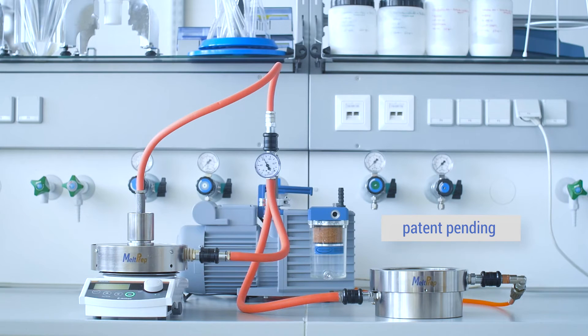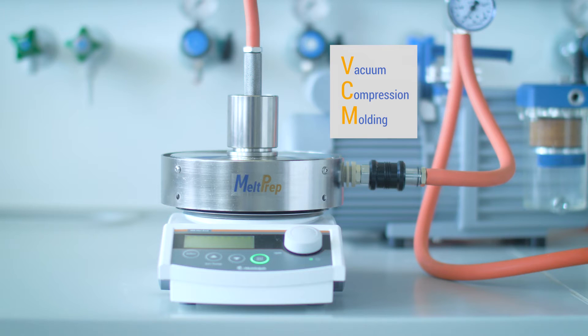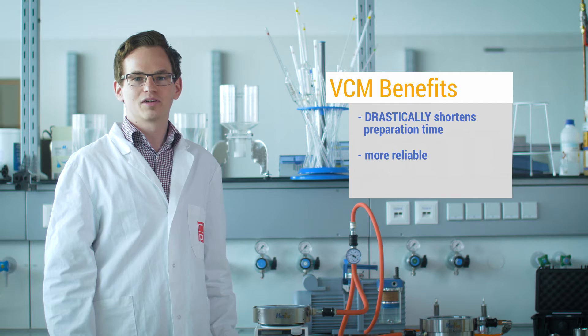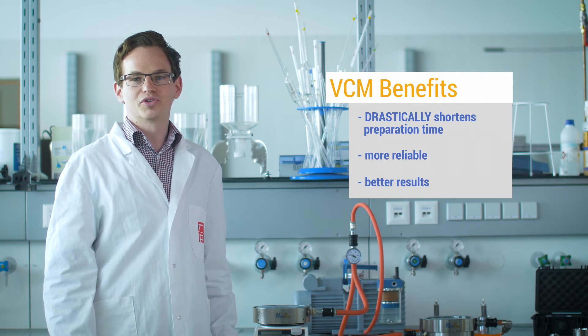I came up with a small scale production process of polymeric samples. It is called vacuum compression molding. It cuts down preparation time to a few minutes, all the while being more reliable and producing better results.